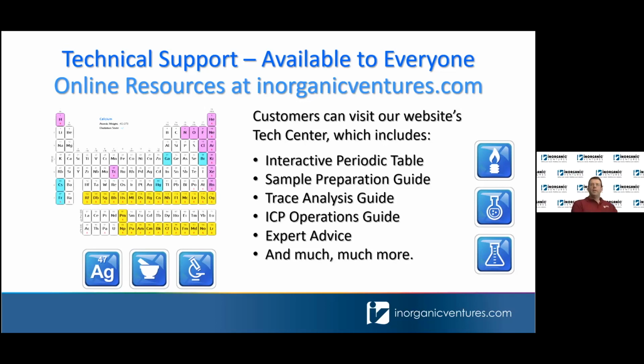Okay, great. So continuing the tubing discussion, do you switch out just the pump tubing or all of the tubing, including the sample probe tubing, tubing going to the nebulizer, et cetera, when you're really trying to deal with washout considerations? Is it necessary to do that? Generally, it's the peristaltic pump tubing that's the major offender. But as I mentioned before with the sample loops, all that other tubing is the same kind of tubing. It will get dirty over time, but it is much more resistant than the pump tubing. It's just because of the material itself.